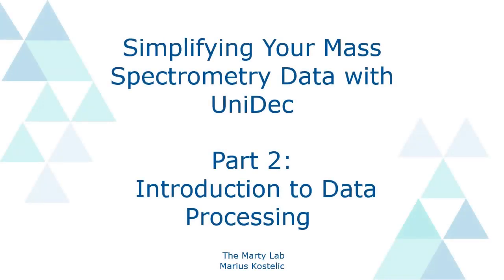Hello everyone and welcome back to the UniDec tutorial series. My name is Marius Kostelik and I'm a graduate student in the Marty Lab, and in this video we will be introducing data processing features in UniDec.